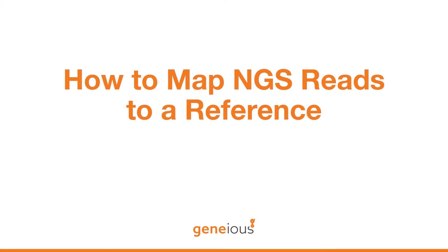In this video, we will show you how to map NGS data against a reference sequence using the Map to Reference tool in Geneious.